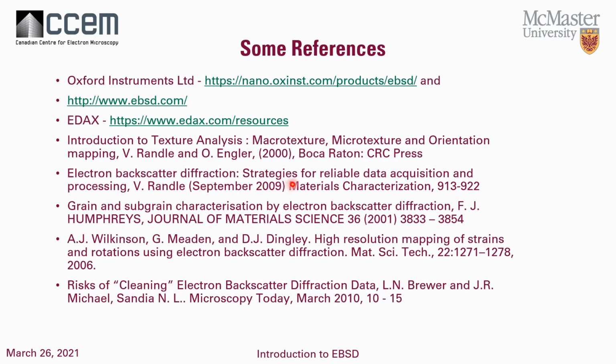Valerie also did a very nice review paper where she talks about strategies for data acquisition and processing in EBSD. Humphreys did some nice information about resolution involving grain and subgrain characterization. He also did a program called VMAP for processing EBSD data from cubics as well. Angus Wilkinson at Oxford has done a lot of work on strains for EBSD, so a lot of helpful information there.